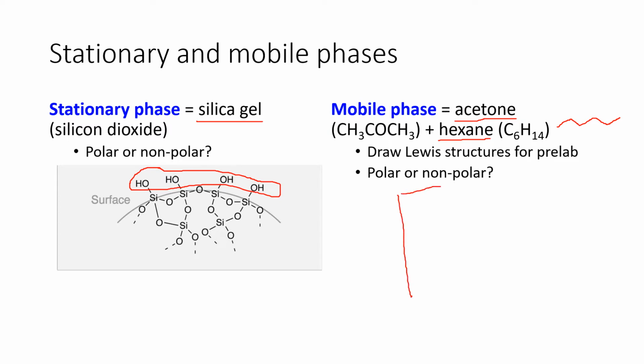When you load your sample on the TLC plate, the mixture will dissolve in the solvent, and the solvent will carry them over and move up. The nonpolar components will interact with the relatively nonpolar mobile phase more strongly, so they'll move very fast and appear on top of the plate.